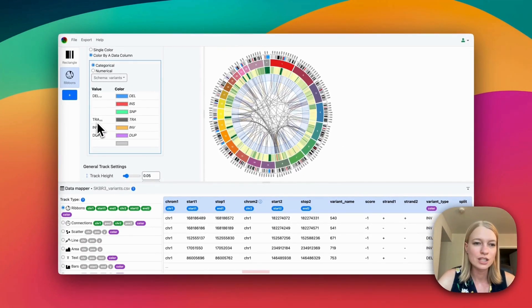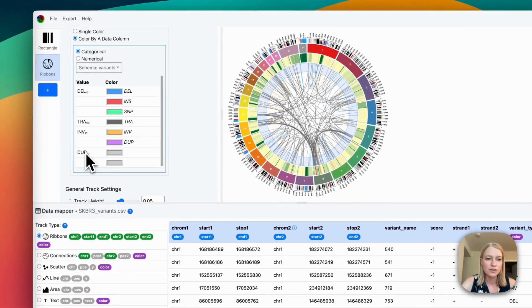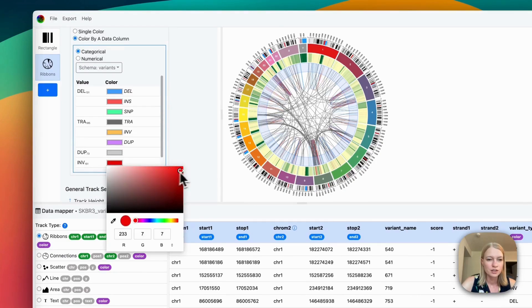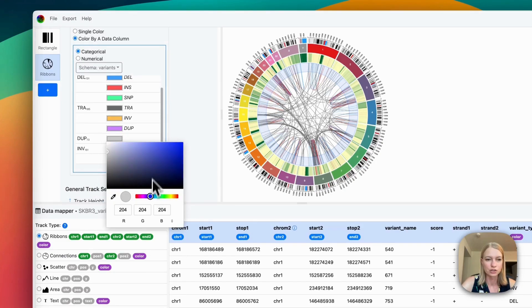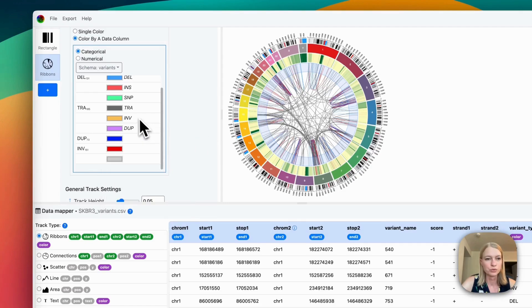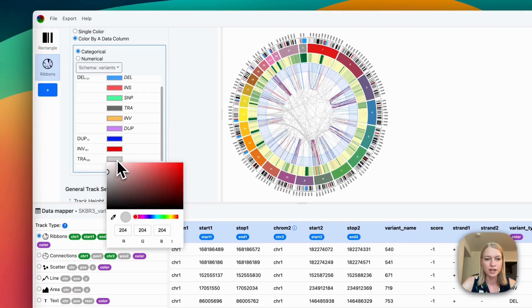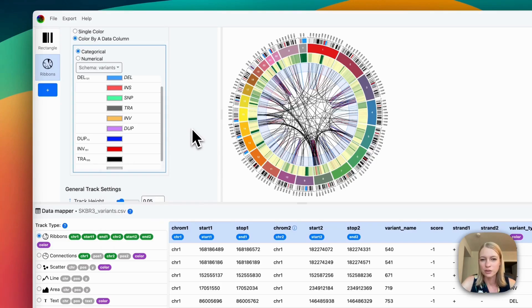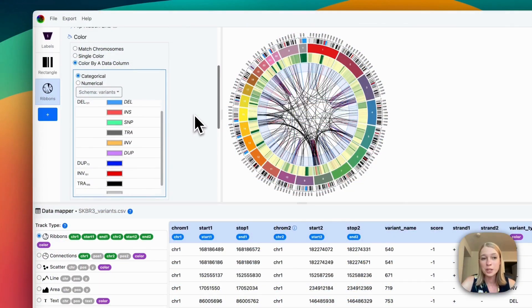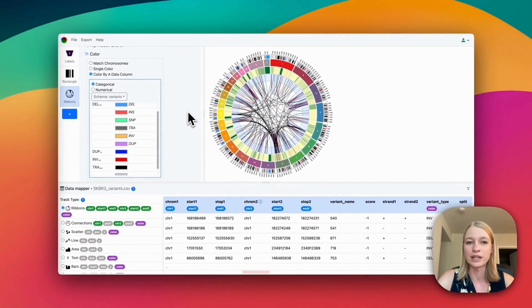But you can always change these colors, and you can even add additional colors if you want to. For instance, making inversions red and duplications deep blue. And we've got to change the translocations too — those are the ones in the middle, so they look really cool — let's make those black. Two hours later. So you can really play with colors in a lot of different ways, very easily in Circa 2.